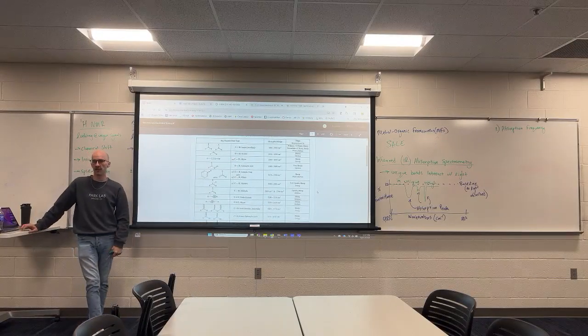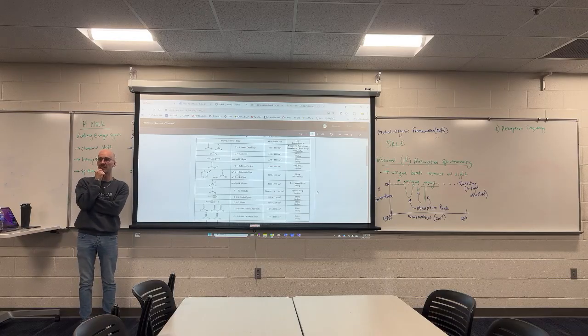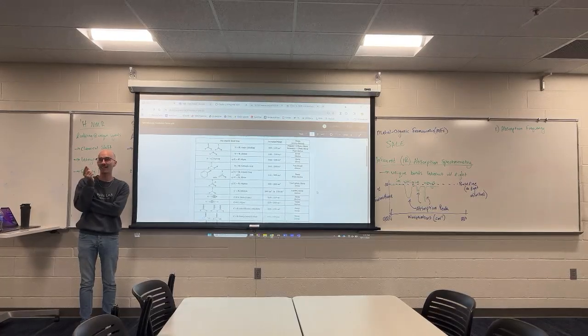You can't just look at a molecule and say, I think there will be CH absorption. Yes, probably. Organic chemistry is the study of hydrocarbons and their derivatives. There probably will be CH absorption. What kind of CH absorption are you looking for? Because those will show up differently.